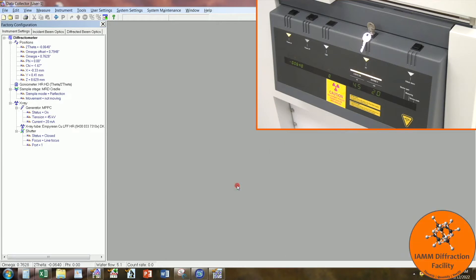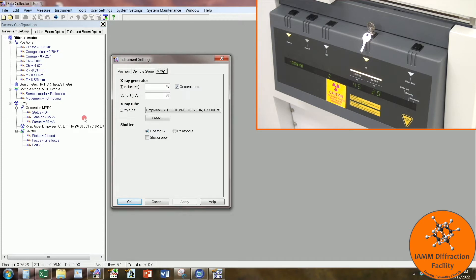This video will focus on the XPERT3 MRD from Malvern Panalytical. In order to switch to point focus, you come in here to instrument settings and you can double click on this. Click on point focus and apply.